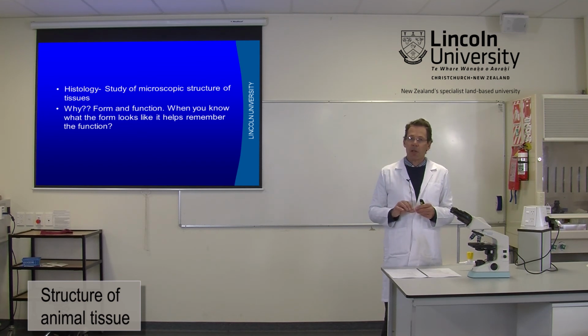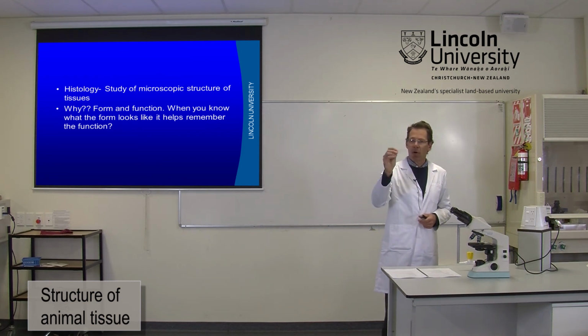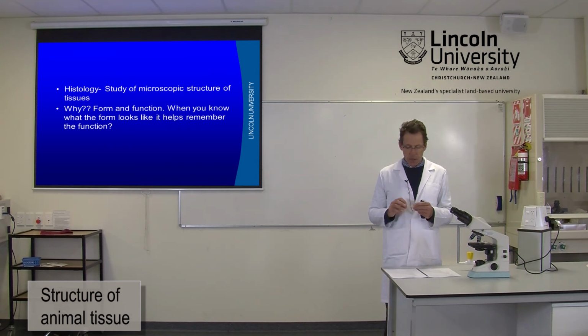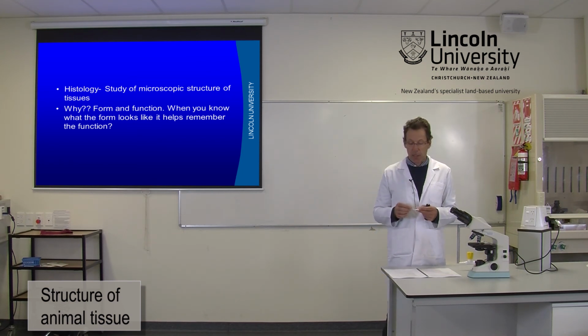When you slice any animal tissue that thinly, the tissue is colourless. So it's virtually invisible on the microscope slide. So when you look at this bright pink piece of tissue here, and when we look at it under the microscope and we see different colours, all those colours are introduced after the section is cut by adding dyes and stains to the tissue. So they're all synthetic colours. The natural colour of the tissue is completely colourless.